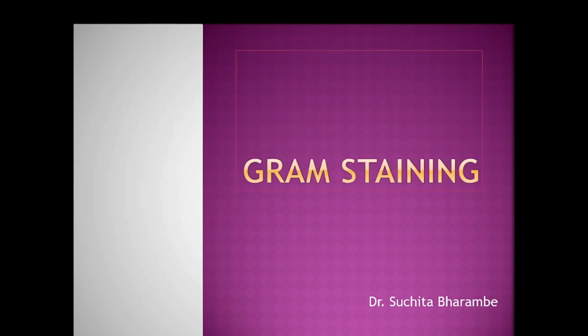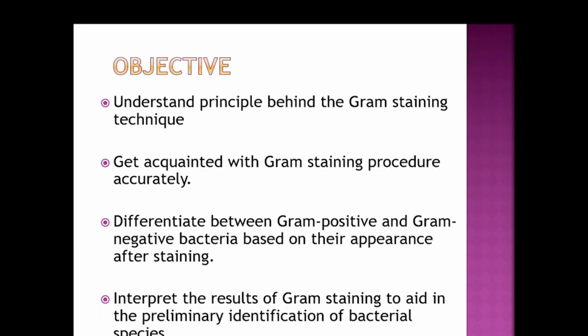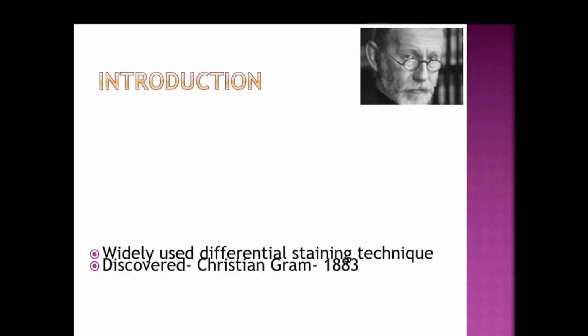So today we are going to explore the fascinating world of gram staining. Objectives for today's session are to understand the principle behind the gram staining technique, get acquainted with the gram staining procedure accurately so that we can differentiate between gram positive and gram negative bacteria based on their appearance after staining. And finally, to interpret the result of gram staining to help in preliminary identification of bacterial species.